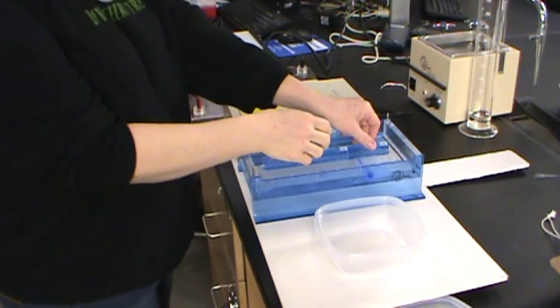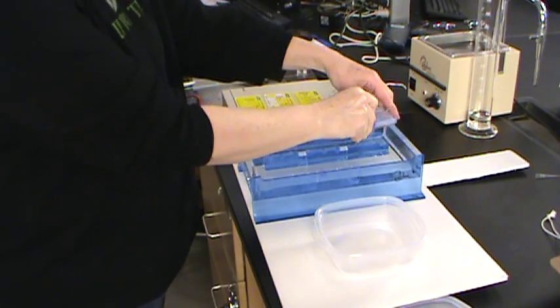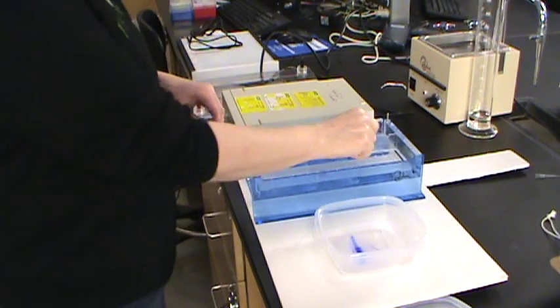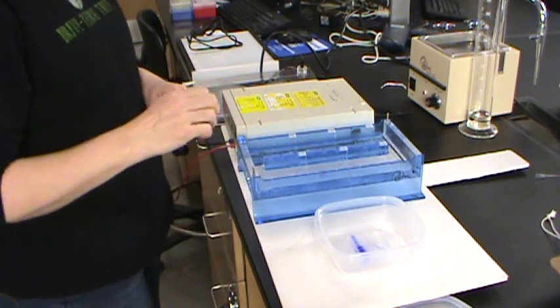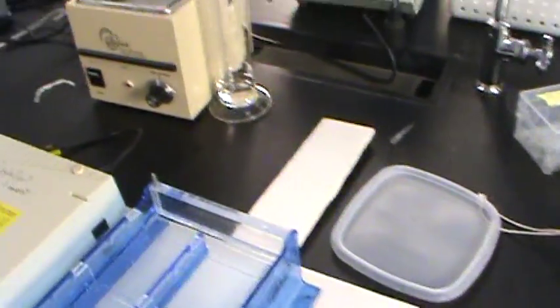There are some kinds of stains where we're not going to want to touch this with our hands. However, this one should be just fine. So we'll be able to take it out and place it in our Tupperware container or in a large weigh boat, either way. And so we'll have that down there. Now we're going to do staining very easily. Sometimes you can actually pour stain into your container. I'll show you what this looks like in here right now. Just got this in the Tupperware container.